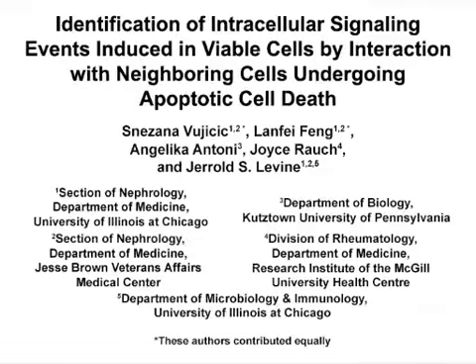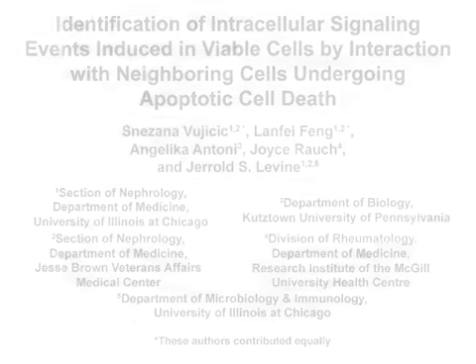The overall goal of this procedure is to identify signaling events induced in viable responder cells following their physical interaction with nearby dead cells. This method can help answer key questions in the fields of cell biology, pathology, and physiology, such as the influence that dead or dying cells exert on their live neighbors.